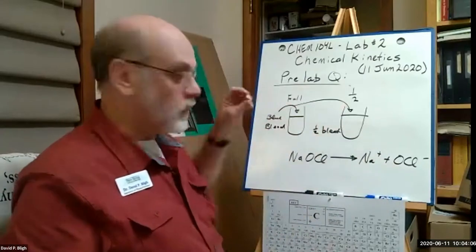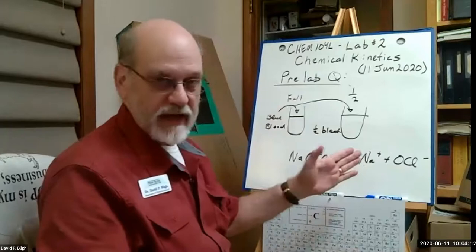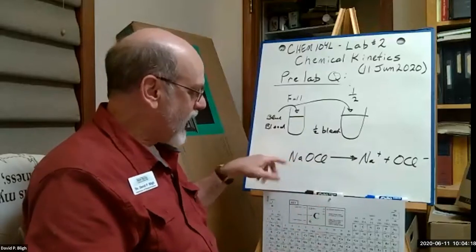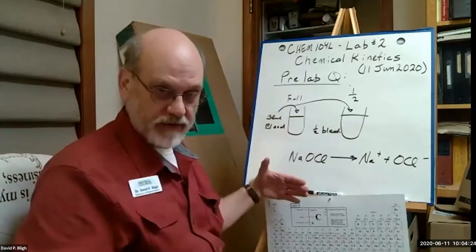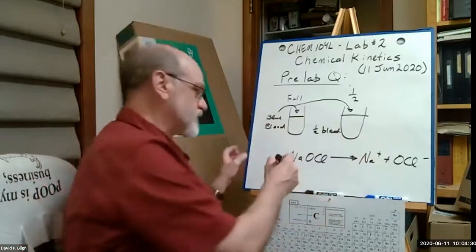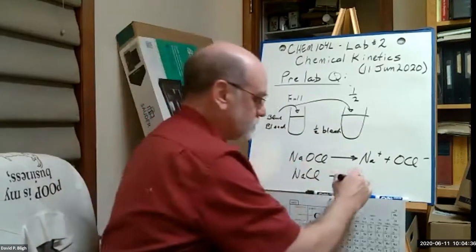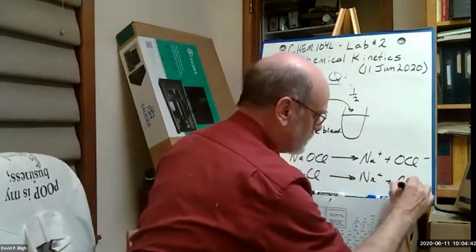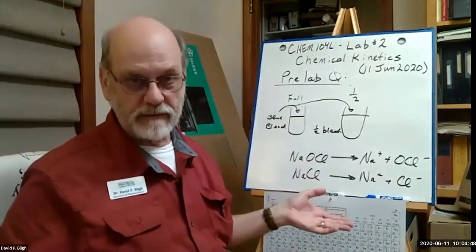Right? So we need to balance the number of ions, the number of cations, the number of anions. The easiest way to do that without affecting the action of the bleach itself is to use something of similar strength, ionic strength, but without the reactivity. And as it turns out, table salt does that. Right? There's your sodium, and here's your anion, the chloride anion. It has no effect on the blue dye whatsoever.